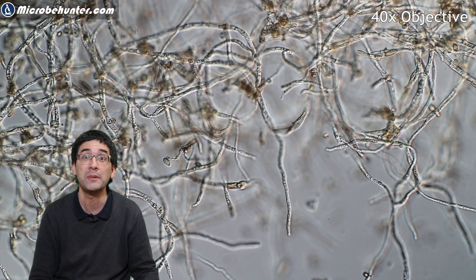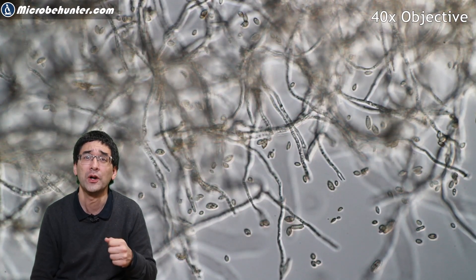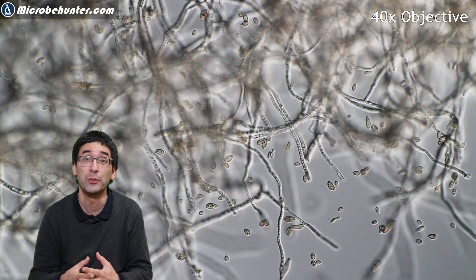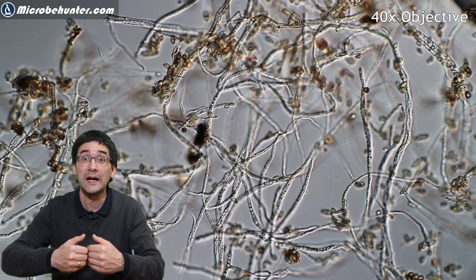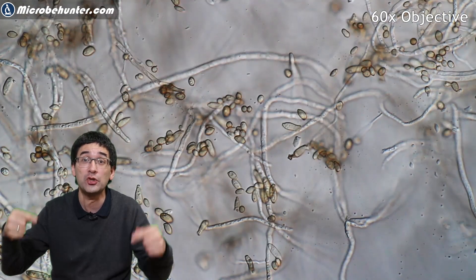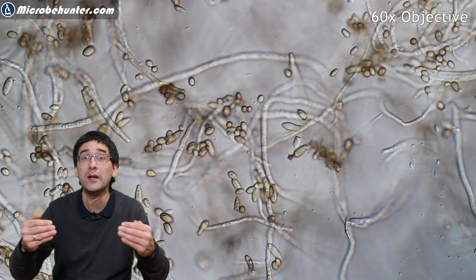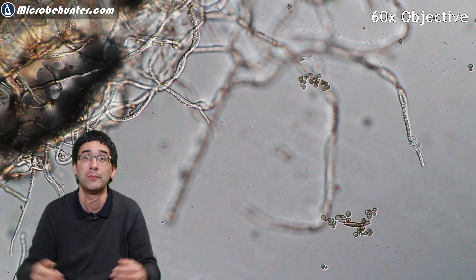Under the microscope you can see the nice mycelia — the cells of the fungus — and also the spores. Those spores are the things you want to avoid, because if you inhale them it's not so healthy, and in some people a large number of spores can cause allergies. The second problem was that the cupboard was really close to the wall, so there was not enough air circulation behind it. If you have a cupboard, move it a few centimeters away from the wall to allow any moisture that forms to escape much more easily.